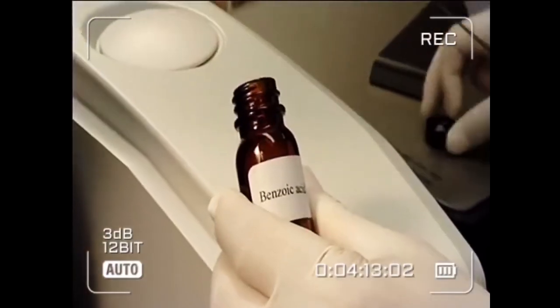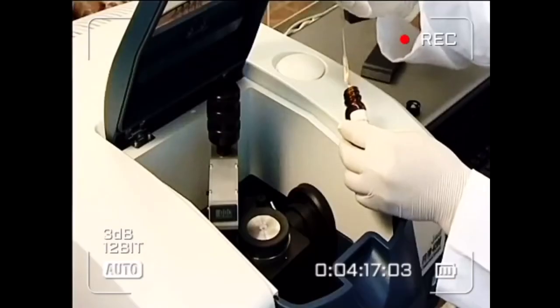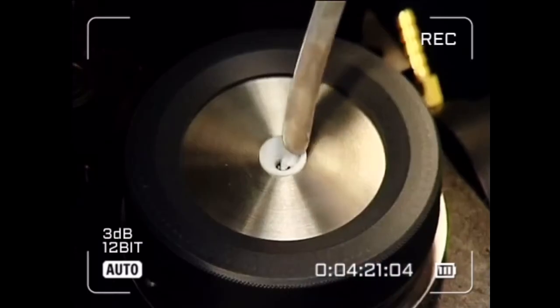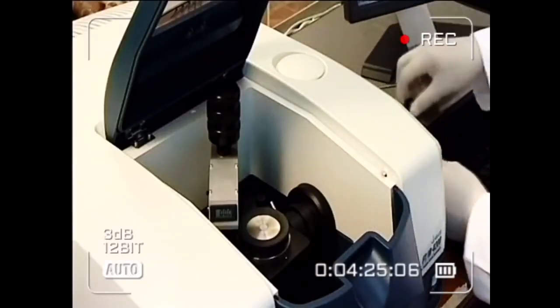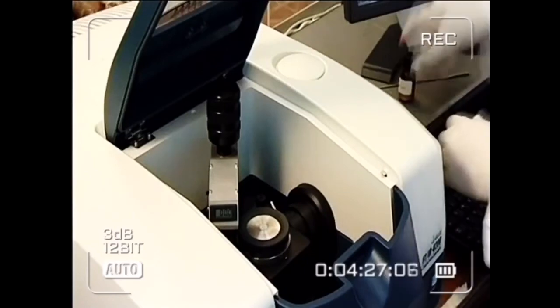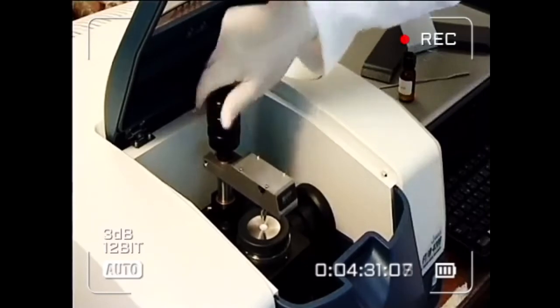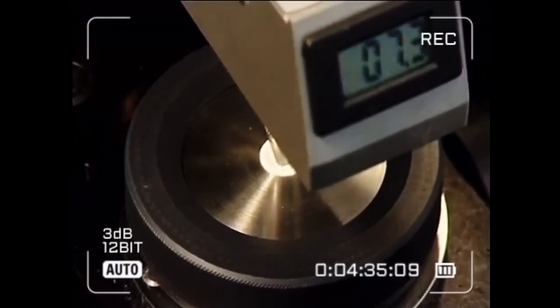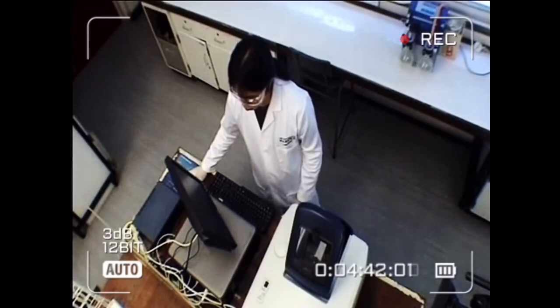Here, the chemist runs the IR spectrum of solid benzoic acid. The instrument is switched on and the blank is run with no sample in place. This is to find the absorption of the air, which must be subtracted from the data of the sample. These details of the scan are entered into the computer.